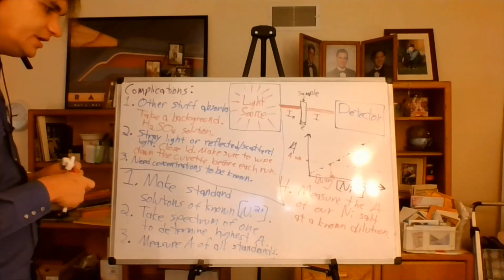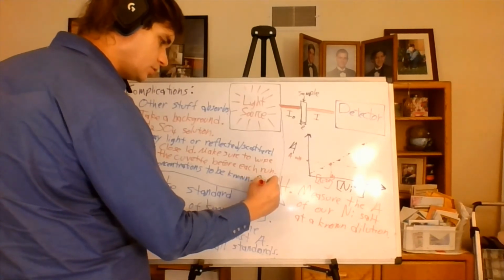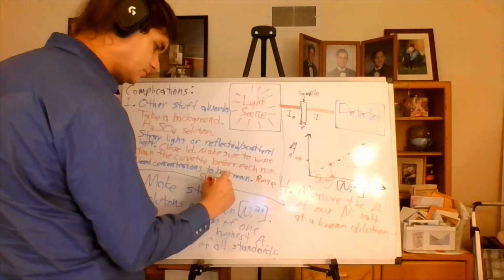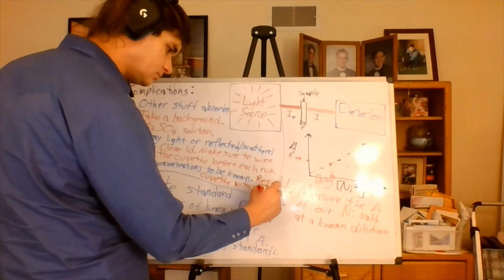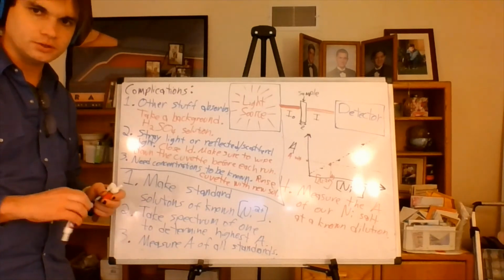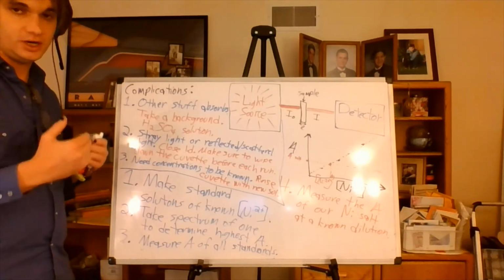So what we need to do in order to ensure this is we need to rinse the cuvette with the new solution. We need to rinse it with the new solution before we actually put the sample in that we want to take the measurement of.